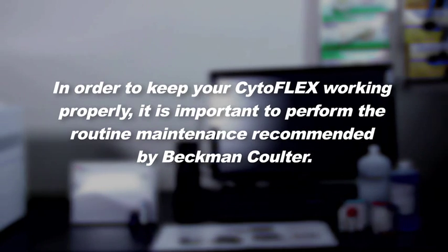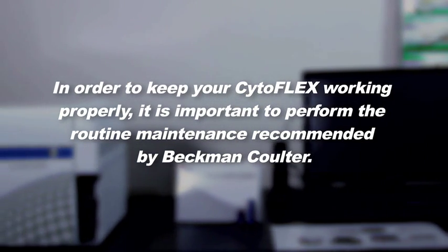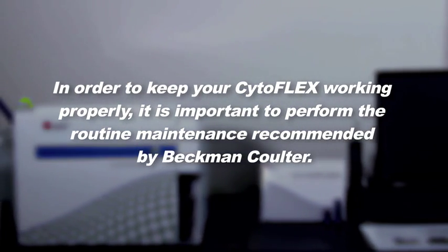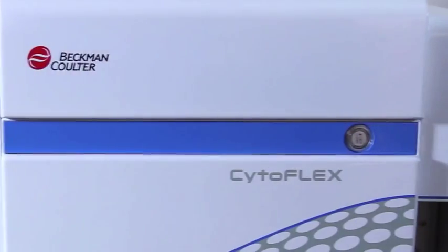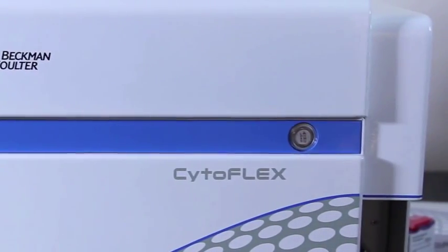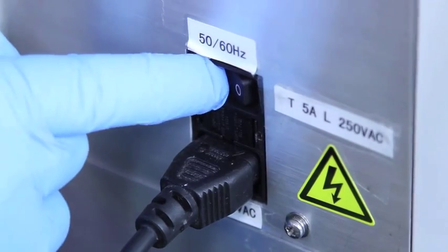In order to keep your CytoFlex working properly, it is important to perform the routine maintenance recommended by Beckman-Coulter. Please make sure your cytometer is turned off and unplugged from any electrical outlet.